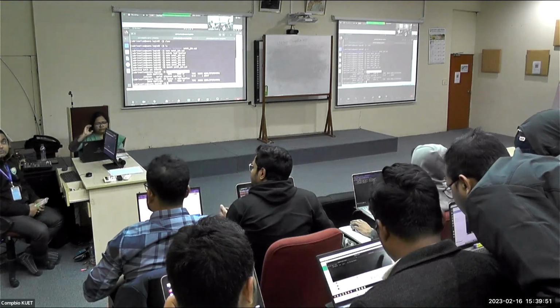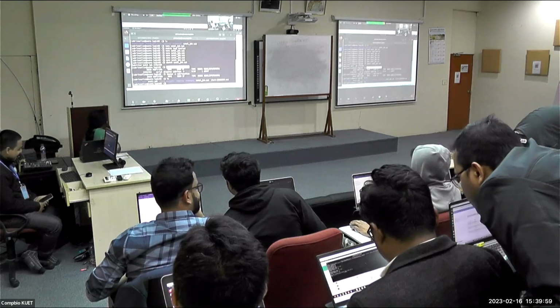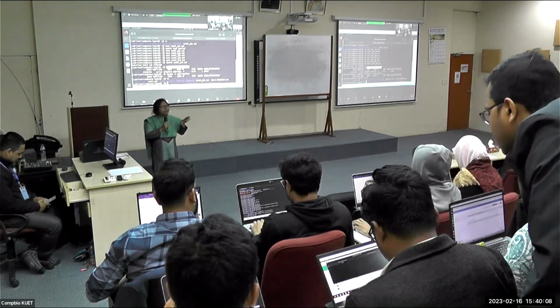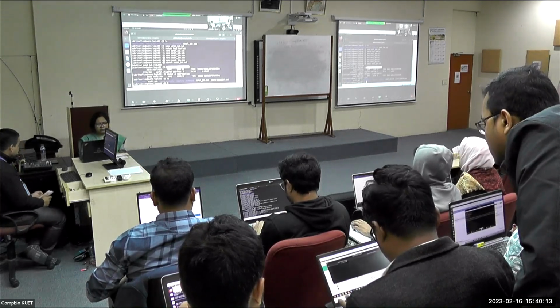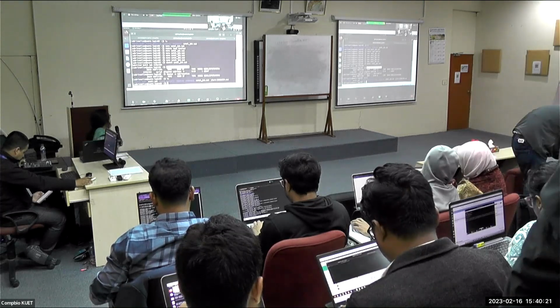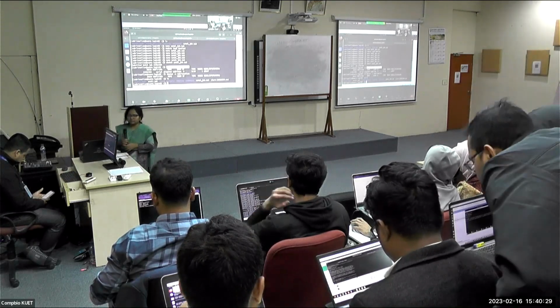To check whether it is already done, I can just type ls and see that I have the SAM file here, ecoli.sam, it is generated. So just check in your computer if you got this file also in your HPC login. In addition, there is another file, slurm out. If there was any error, it will show that, and the progress.